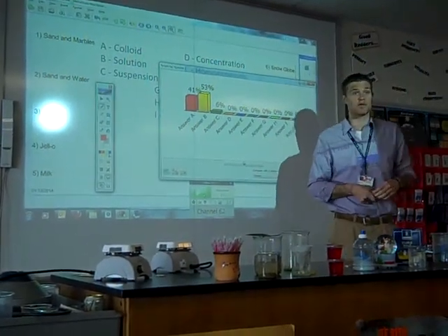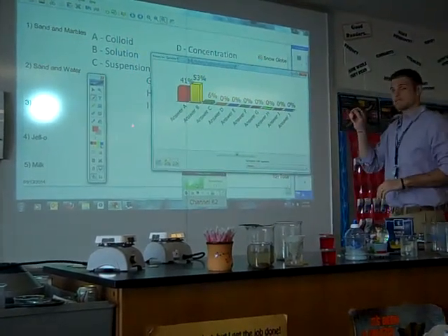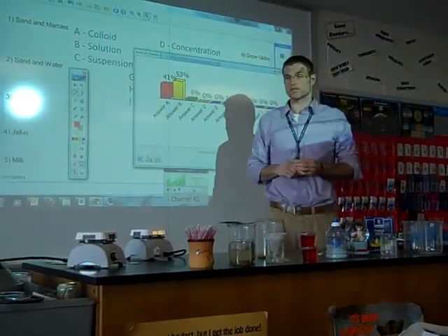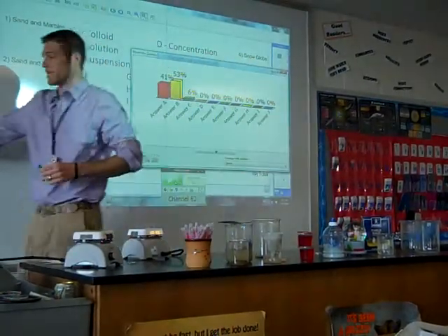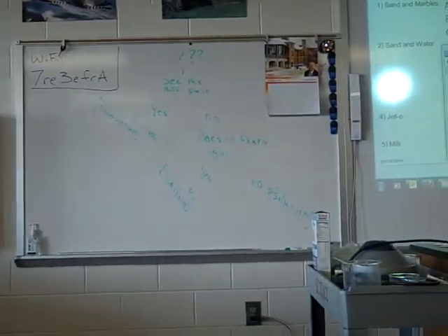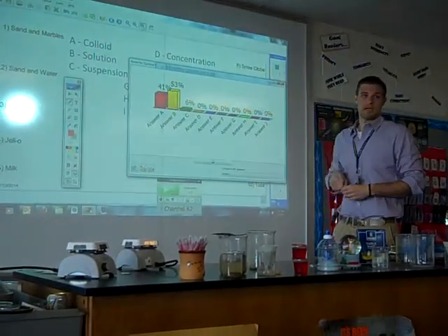Who can give me a test? What can we do? Yes, Mr. Boss. We already checked to see if it can filter. Does it scatter light? No, it goes right through. So colloid, solution, which one scatters light? One of them does, one of them doesn't. Does it scatter light? No. Solution. So it's a solution, right? You can't see the different parts. So air is a solution.